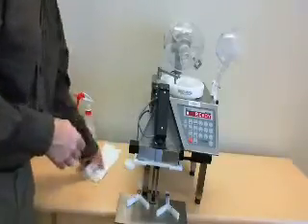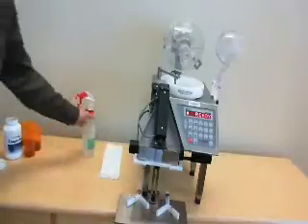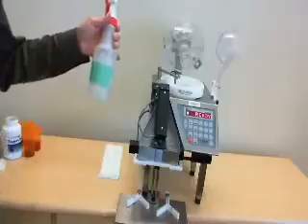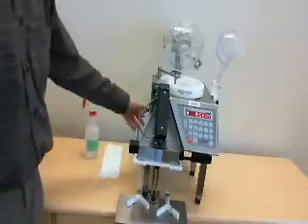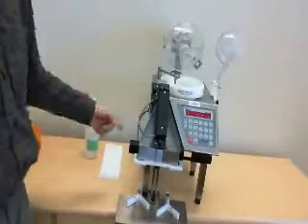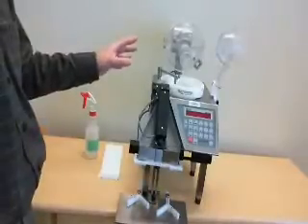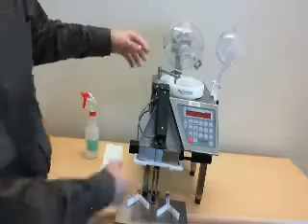For cleaning, you're going to need soft, lint-free cloths and a cleaning solution. For this purpose, we are going to be using a bleach and water solution to do all cleaning. First, make sure that the device is off. The on-off switch is on the left. Next, you're going to be cleaning the areas where tablets or pill dust can accumulate.